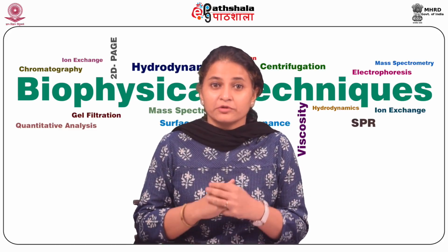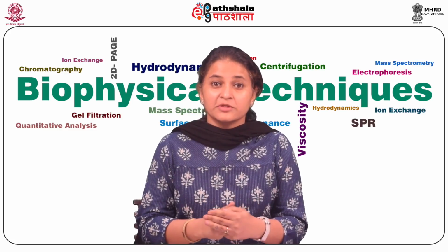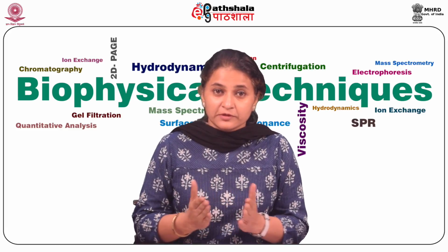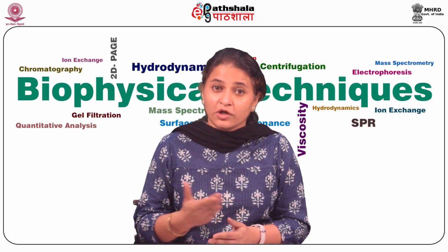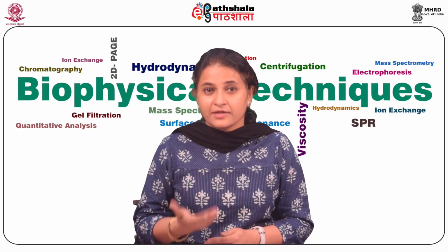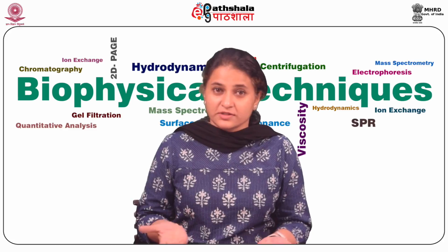So when the sample volume is too high, that means you're typically overloading the column, and so the sample analytes may not resolve to what you desire. So the sample volume, based on the expected concentration of the analyte, has to be optimized before you start your actual analytical process.